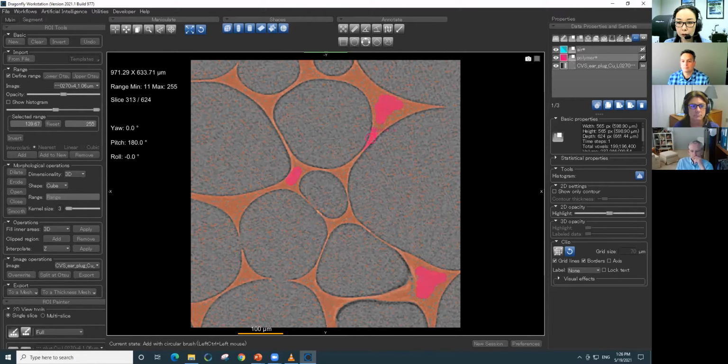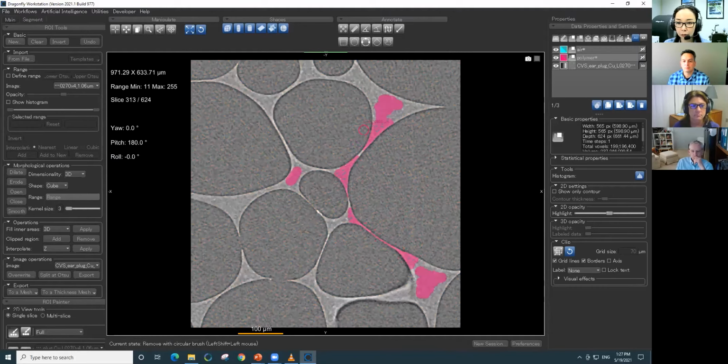Now, I hope you can see this, but this brush is painting only the selected red pixels. So this makes it easier to get the borderline right. And if you have some mishaps like those, that's okay. I can delete them and clean it up. So this is my way of showing an example to the machine.